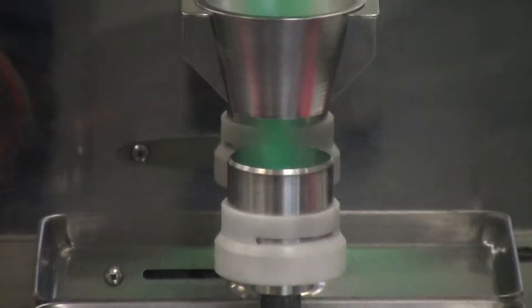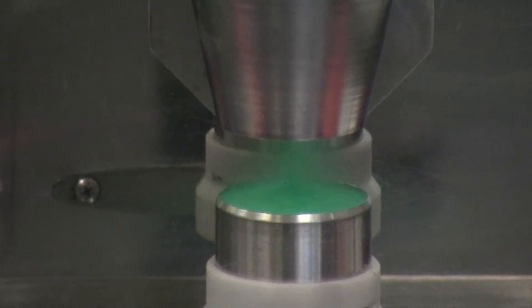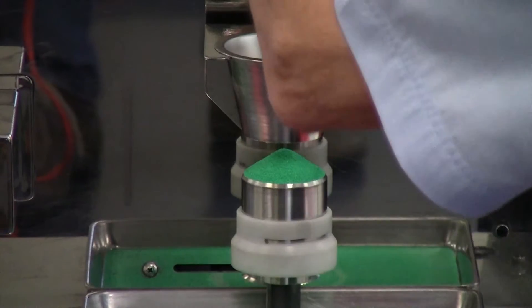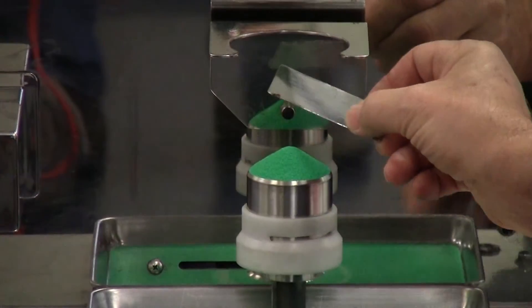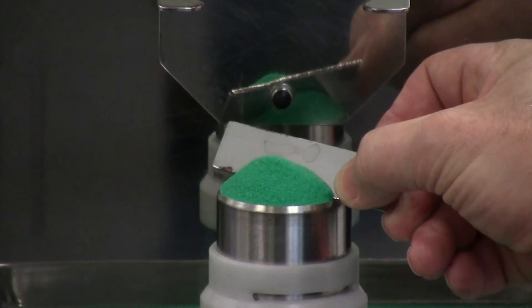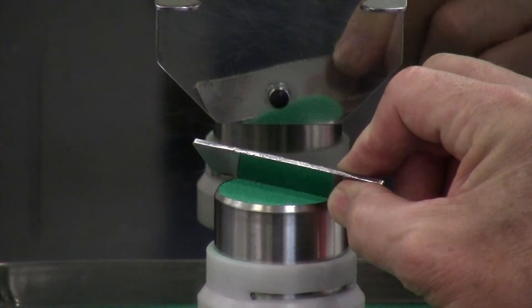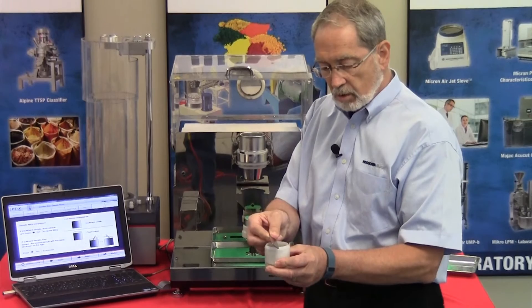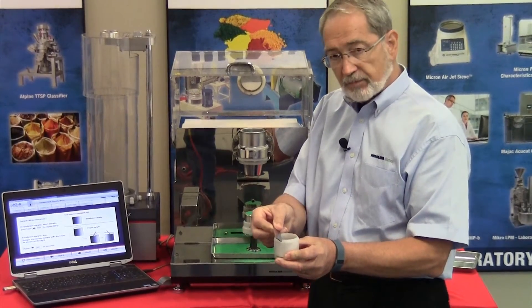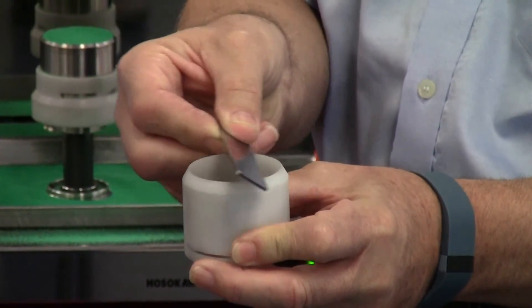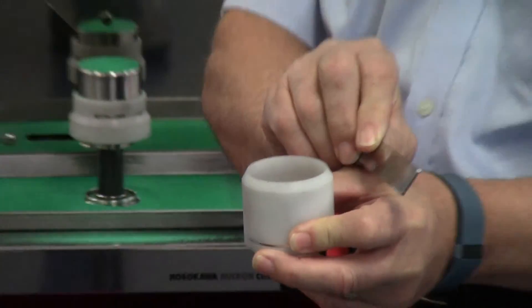In this case, you want to stop the vibration as soon as the cup overflows — and it has now stopped. The recommendation is to immediately open the cover and scrape the cup. There is a unique method shown on the screen: angle across and angle back. Using the cup extension as a guide, you angle across and then back, lifting excess material away rather than compressing it into the cup.